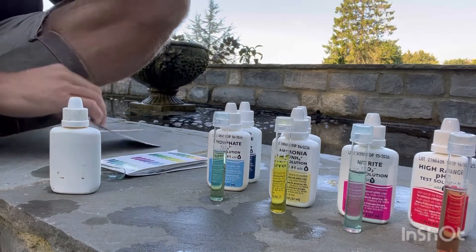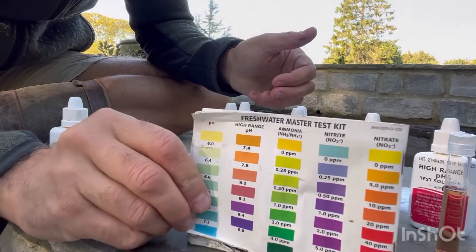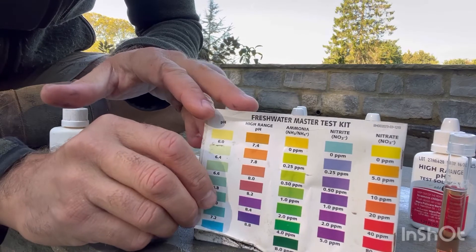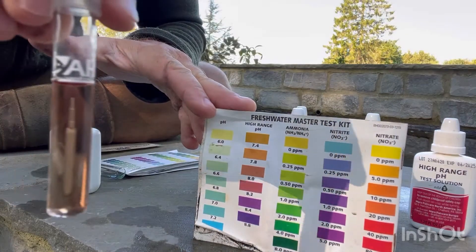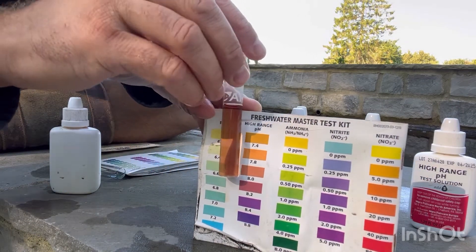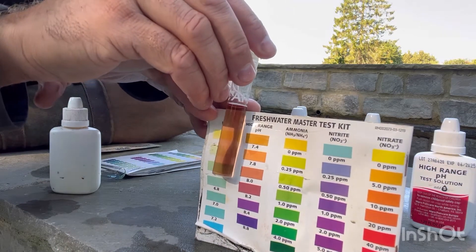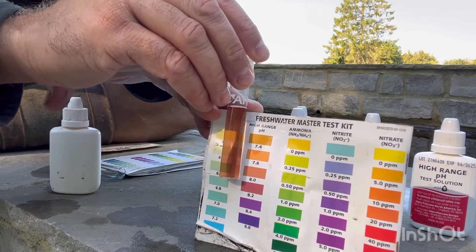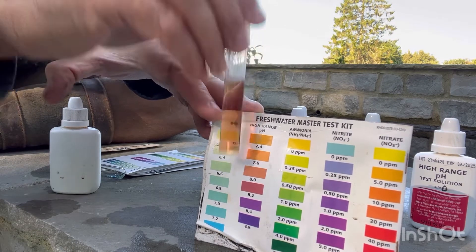I'm back. I've left it a minute or two, and now it's time to test the readings. I'm going to go with high range pH first. Sorry about the quality — it's in the range, that column there. The colors aren't going to come out perfectly on camera, but you can get an idea. I would say it's between 7.4 and 7.8. I'm pretty happy with that — if you wanted to be pedantic, it's a tad on the high side, but I'm pretty happy with it.